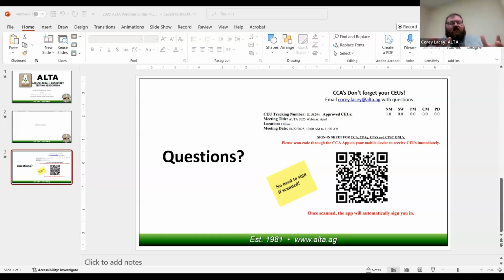Sometimes you put samples on this, you load them and they just sit there on the auto sampler. Does moisture change as they take in moisture from the atmosphere? Does that change as they just sit there in the crucible? How does that impact things? What are your concerns there? I know sometimes there's also this question of, am I trapping some of the nitrogen that's in the air as part of the sample? Can you just speak broadly to that question?